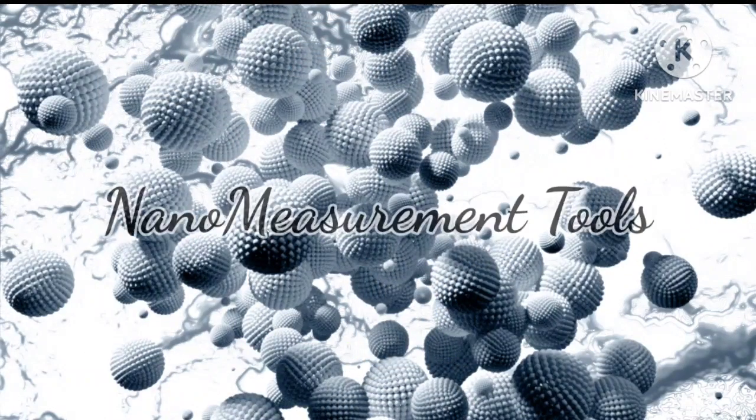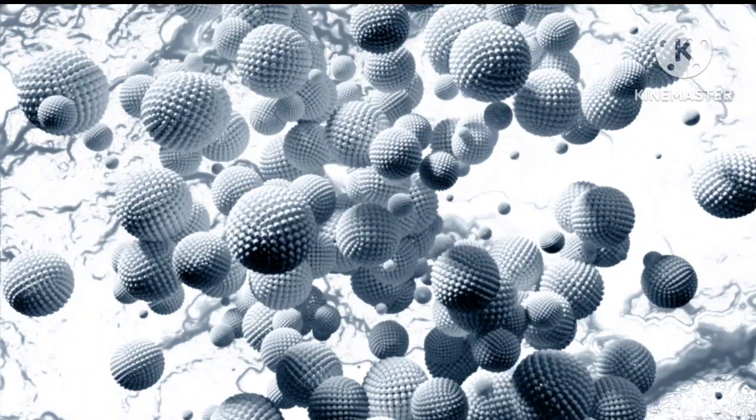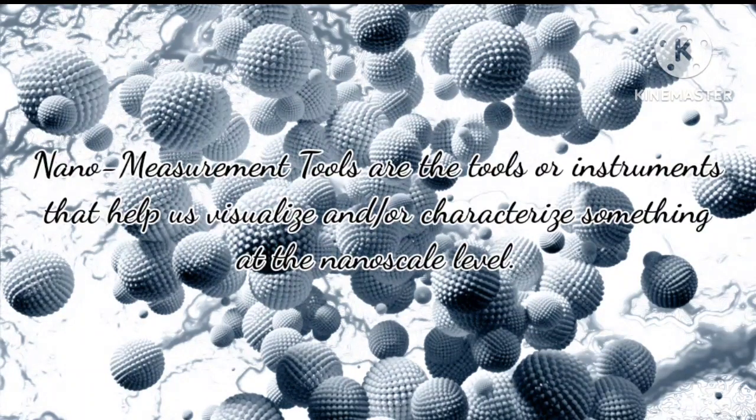In this video, we are going to discuss the nanomeasurement tools that we use in the field of nanotechnology to carry out the measurement process at the nanoscale level. Nanomeasurement tools are the tools or instruments that help us visualize and/or characterize something at the nanoscale level.